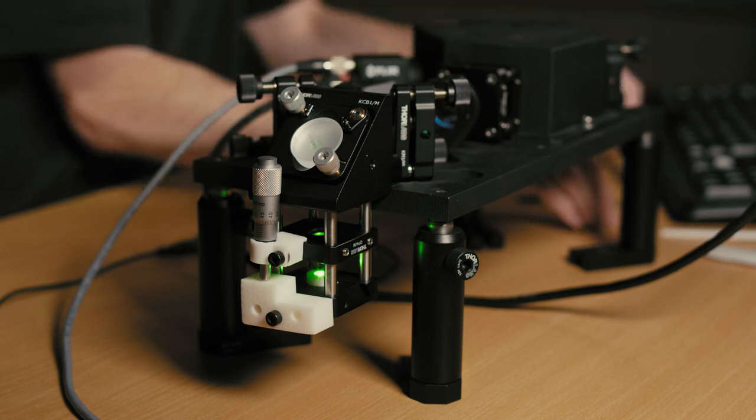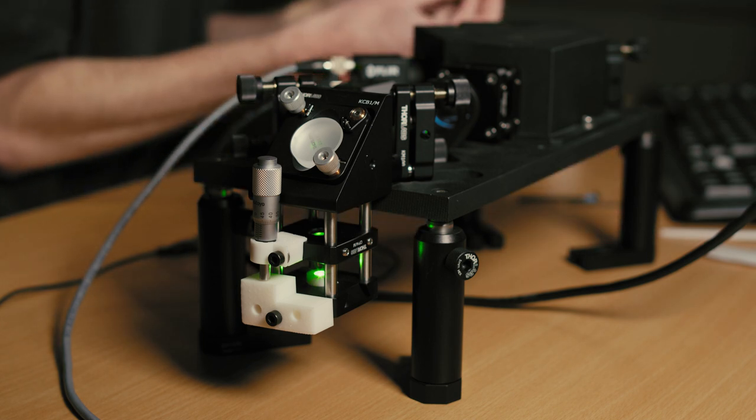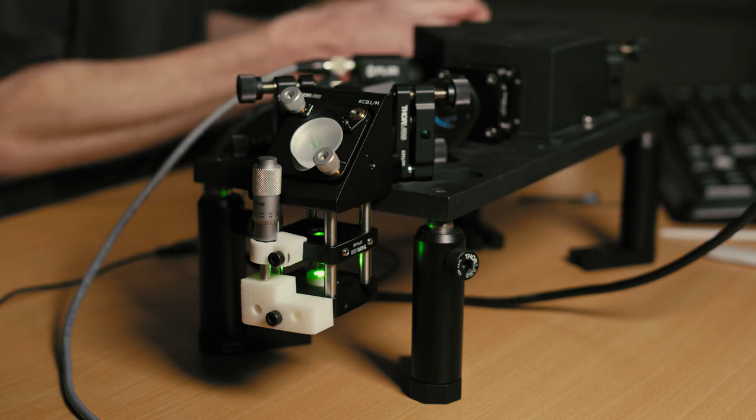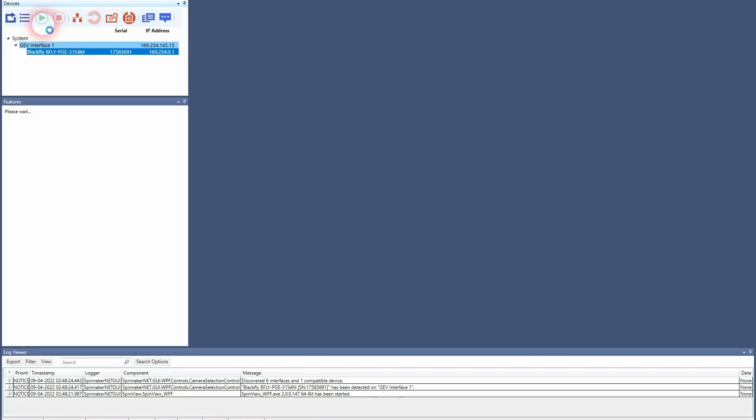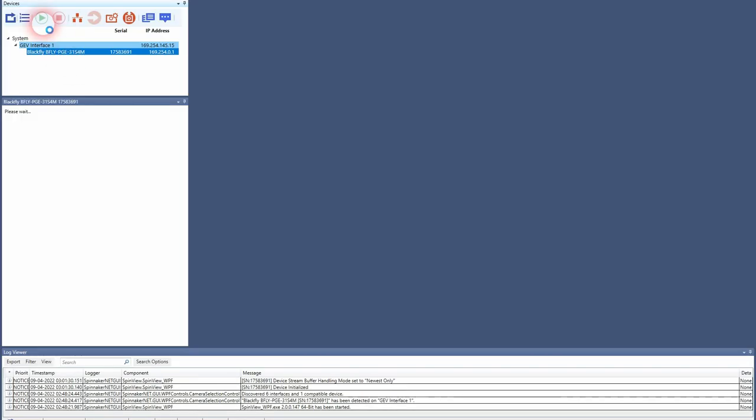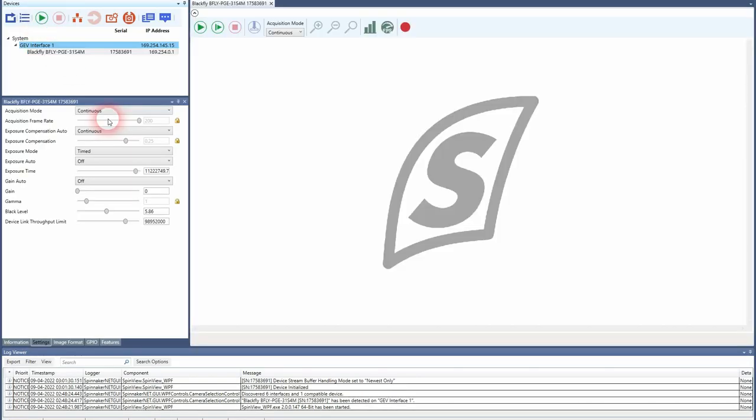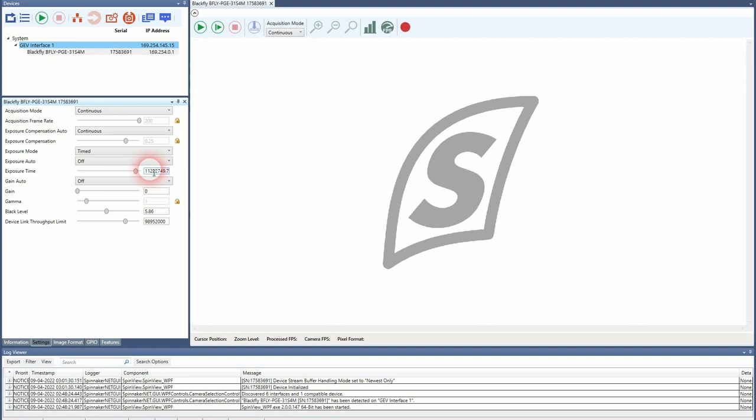Now what you can do is to open the spin view software and connect to the camera. I will set an exposure time of about 100 milliseconds. So it's 100, 1, 2, 3.